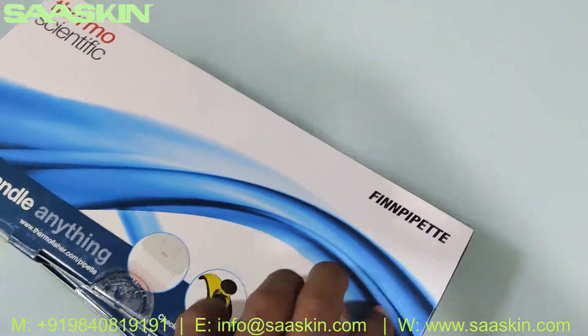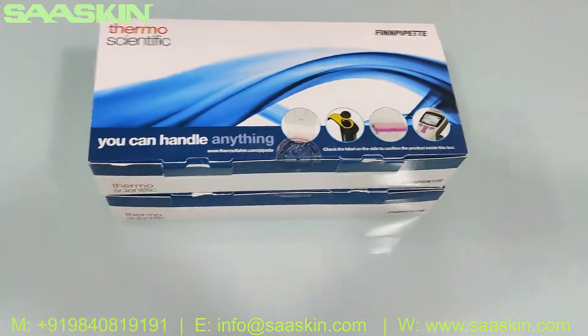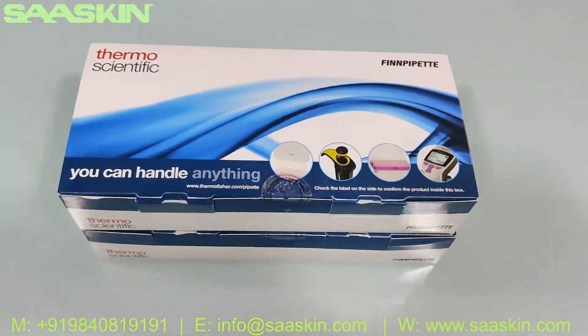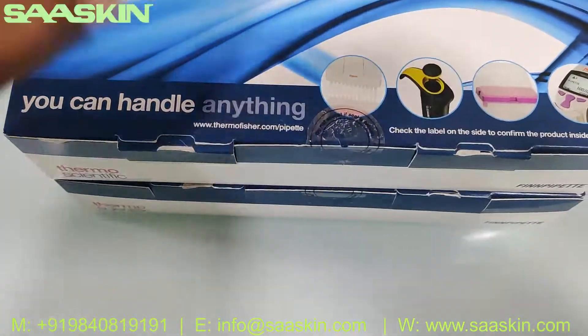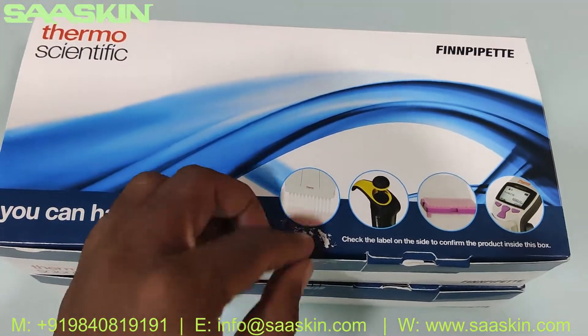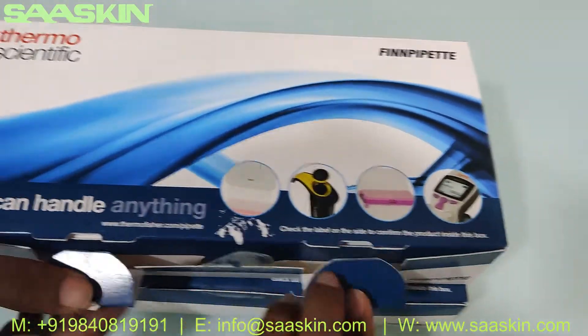I'm going to unbox one kit for you. The contents are the same in both multi-channel kits — the range only varies, but the contents and the model look very similar. So I'm going to unbox one box for you.